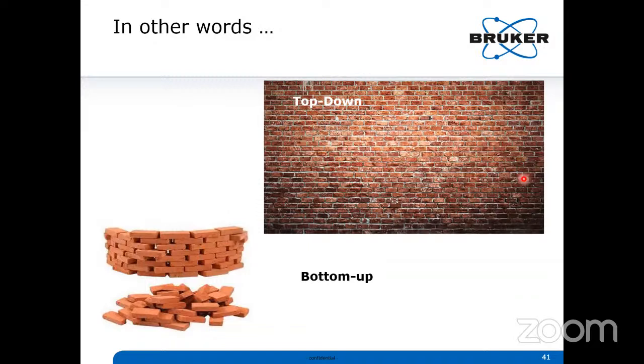There is no confidence level when you are confirming any modification happening from the clone to your resulting protein, by a 2 Dalton or 3 Dalton difference. It is very difficult to confirm at intact level. But if I remove all these bricks and give them to you separately, and ask whether any brick is damaged or what different kinds of bricks you have, it will be very easy for you. Slowly you can take each brick and arrange it. One peptide you will arrange, and after arranging each peptide you will connect them. You will build the complete wall.